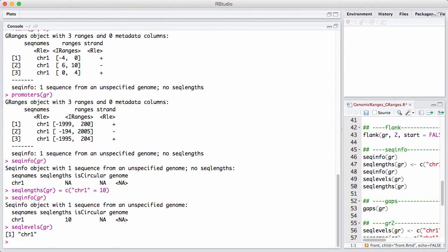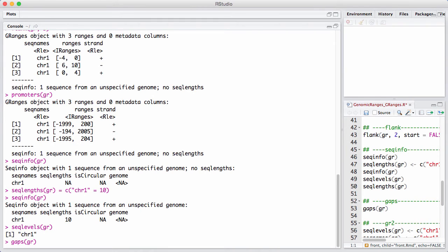And now that we have an end of the chromosome, we can talk about doing operations that are relative to the entire chromosome. An example is GAPS. GAPS is a function that basically gives us all the stuff on the chromosome that is not covered by ranges in the GRanges.